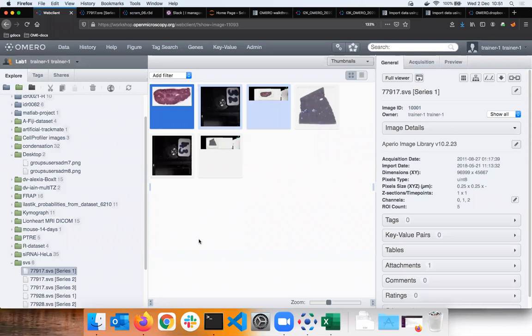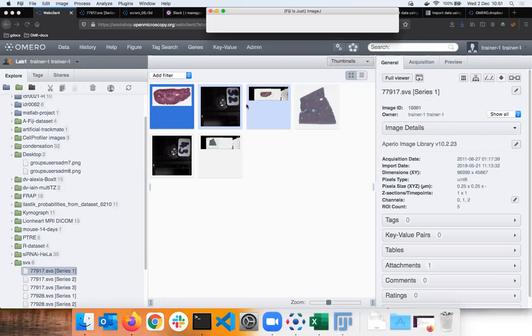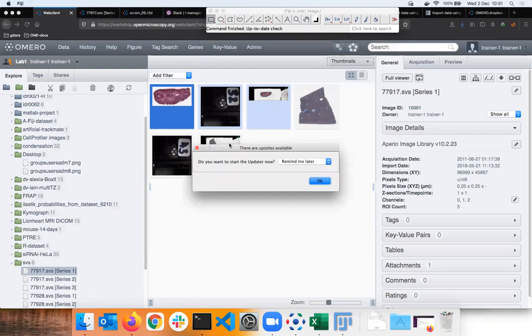I sent you an email previously saying that you might be interested in installing Fiji, and if you've done so, that's the moment when you please start your Fiji and work with me on that workflow, which is again described in the OMERO guides and in your workflow.